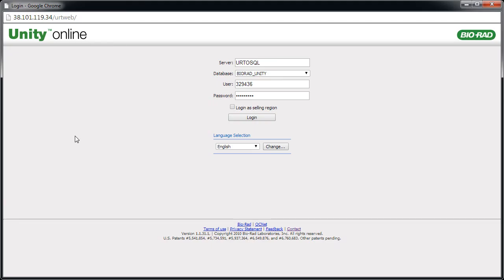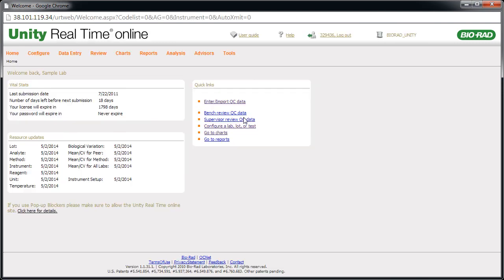The Login screen appears. Enter your user name and password, then click Login. The Unity Real-Time Online homepage appears.